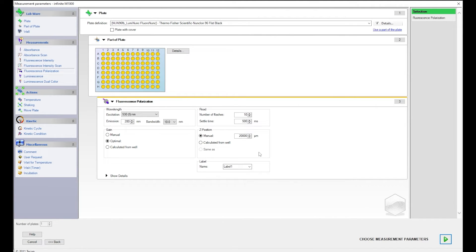From Actions, drag and drop Move Plate below fluorescence polarization. Under Move Plate, select Out.